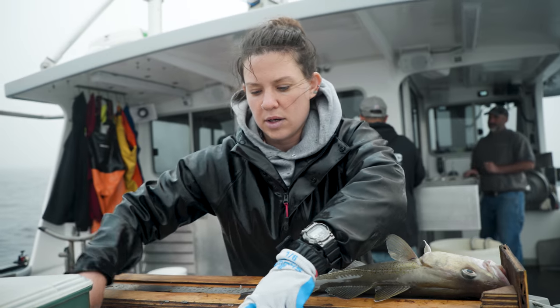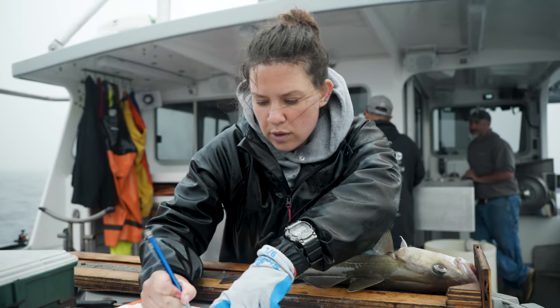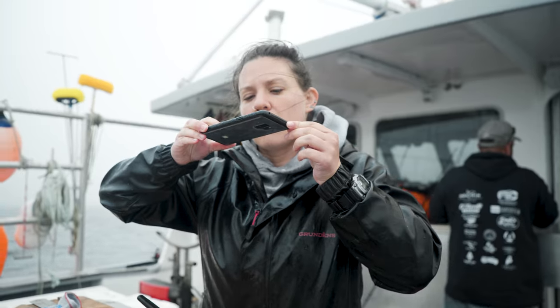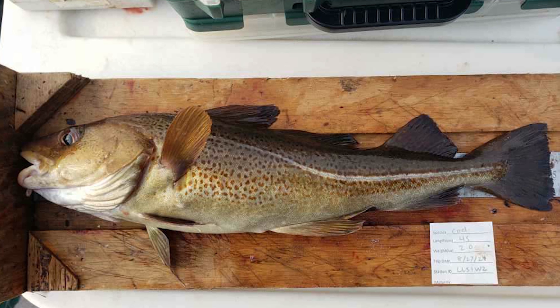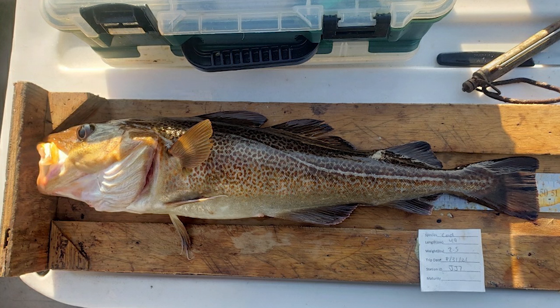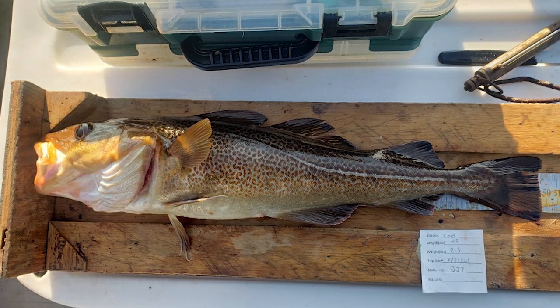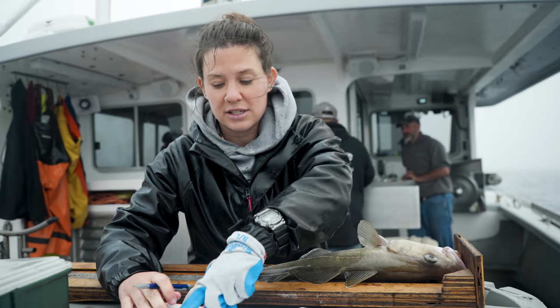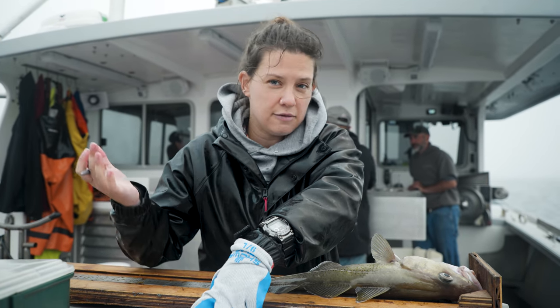I'm gonna take a photo of this which we call a morphometric photo. A researcher can look at the shape of its body — kind of like a combination of the length, the width, and how far different body parts are from each other. They've actually found that that can be different based on where the cod lives.